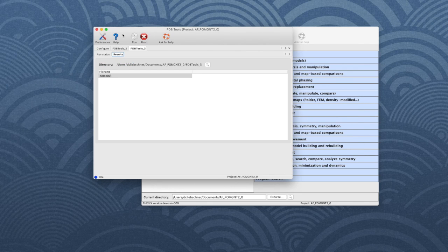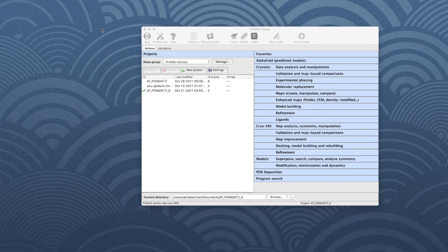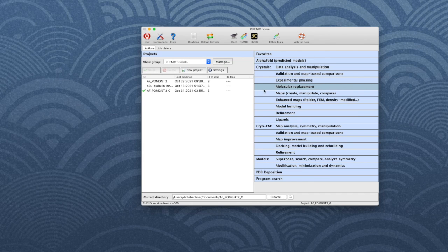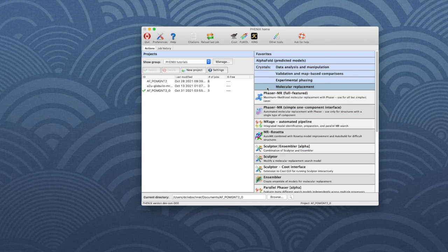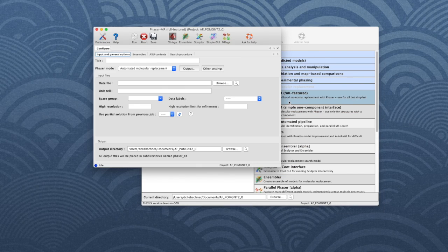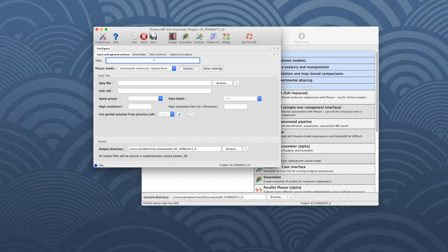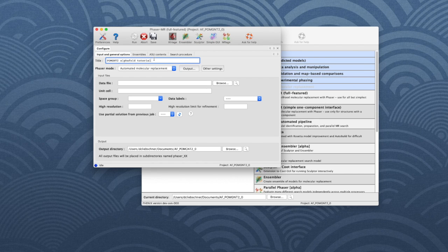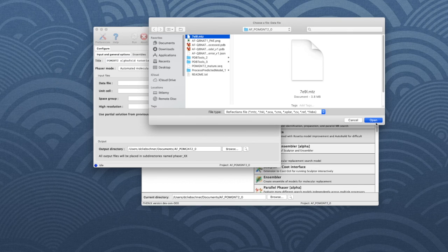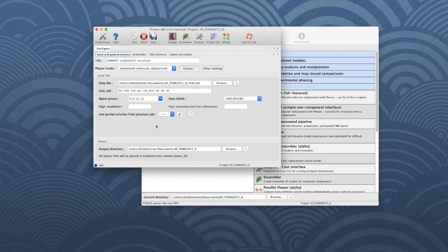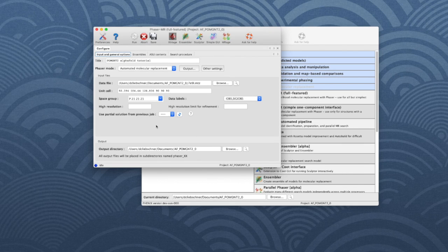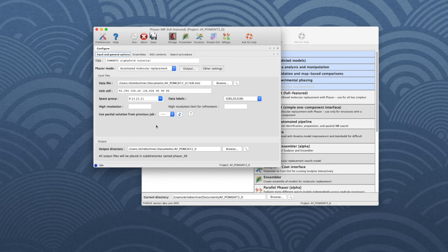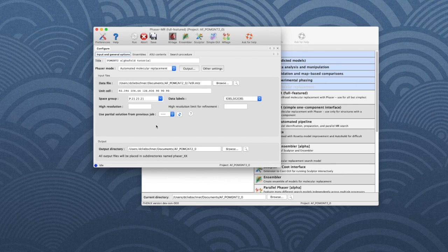Now we are ready to run molecular replacement. In the main Phenix window, choose Molecular Replacement and then Phaser-MR Full Featured. For bookkeeping, give your job a title. Ensure that the Phaser mode is Automated Molecular Replacement. Then we add the file with the diffraction data. Phenix automatically populates the unit cell and the space group fields from the file. Quickly check to ensure that the correct information is used. Then go to the Ensembles tab.